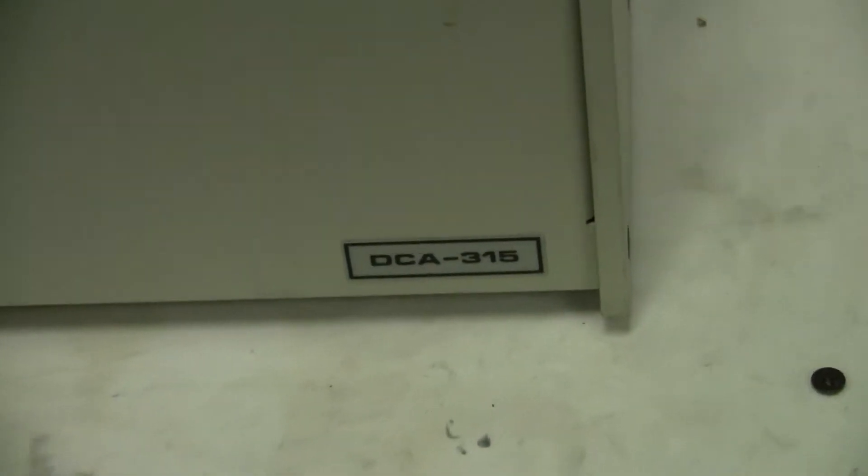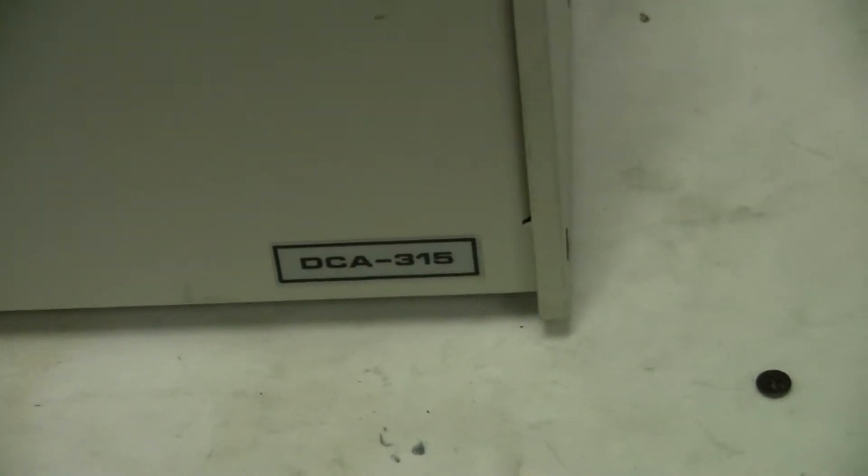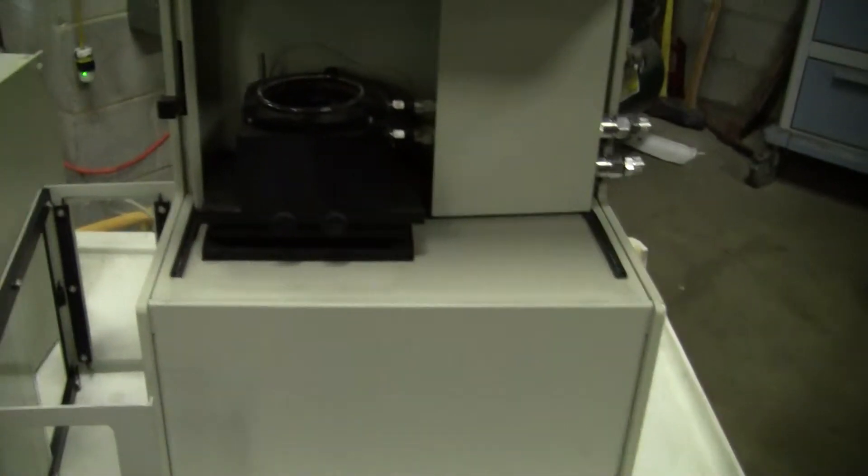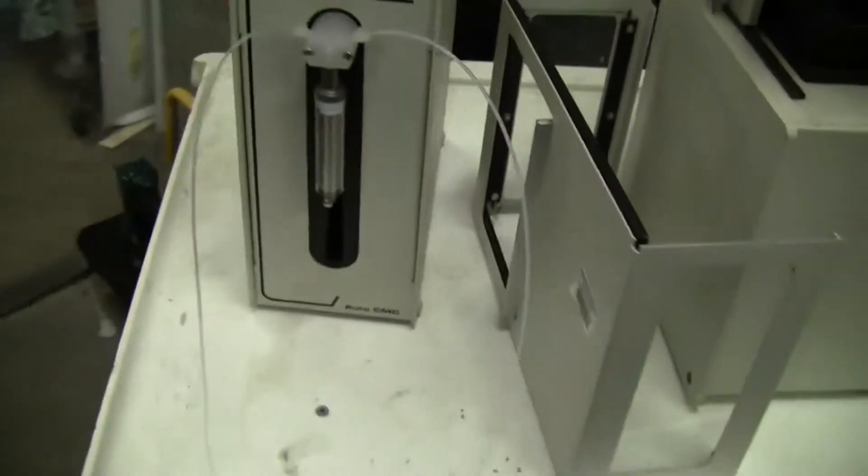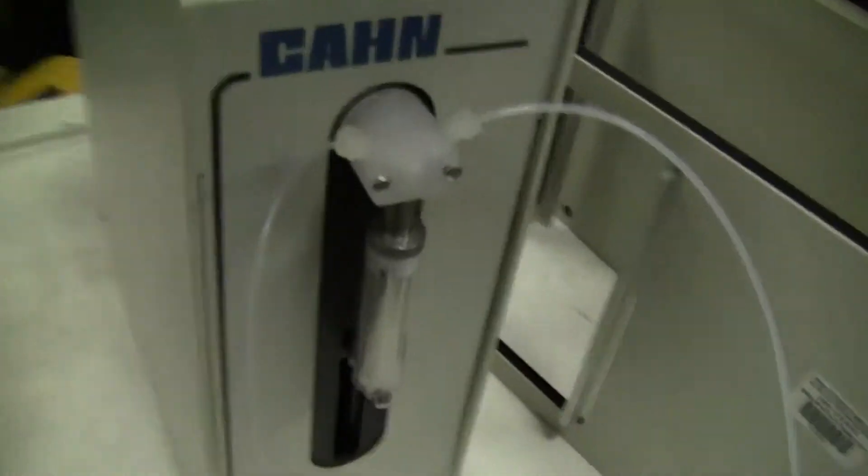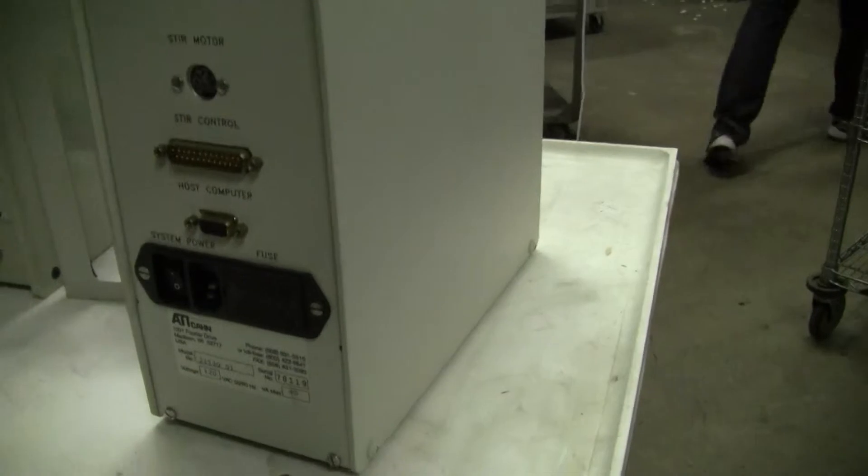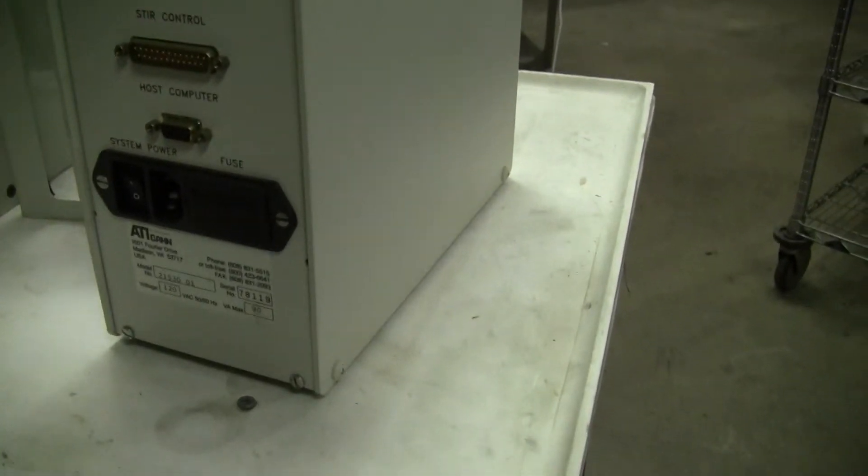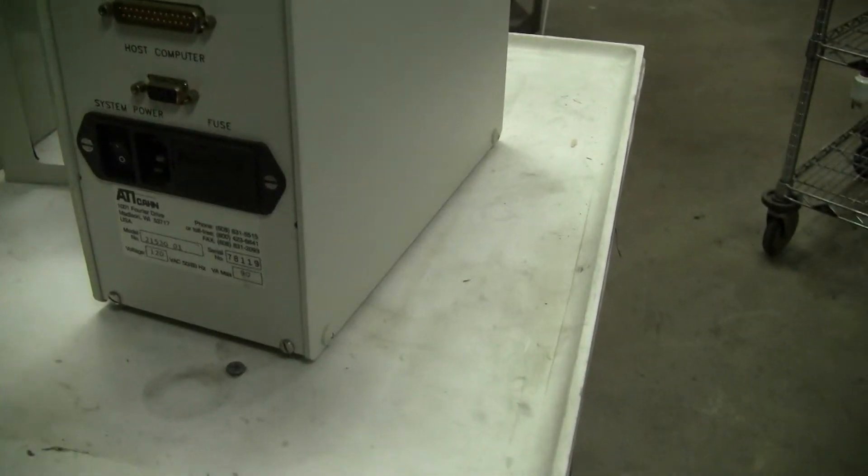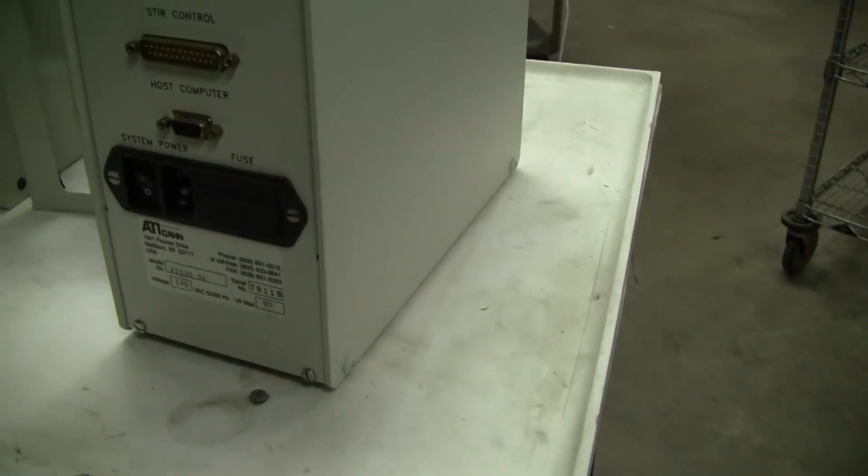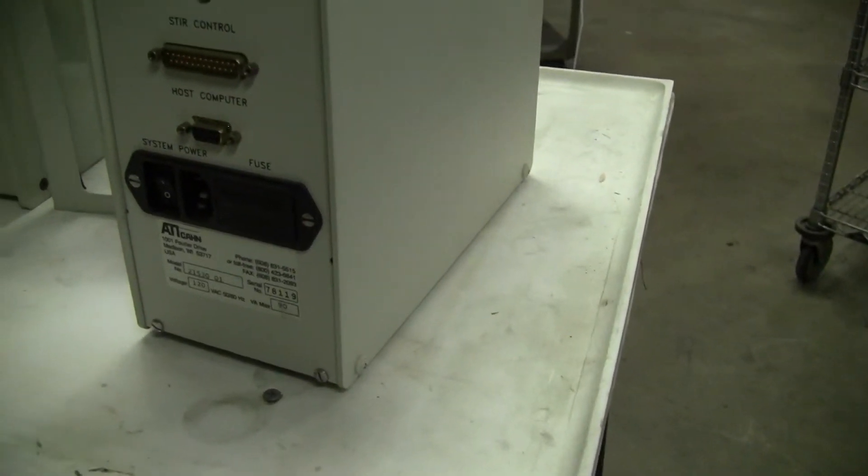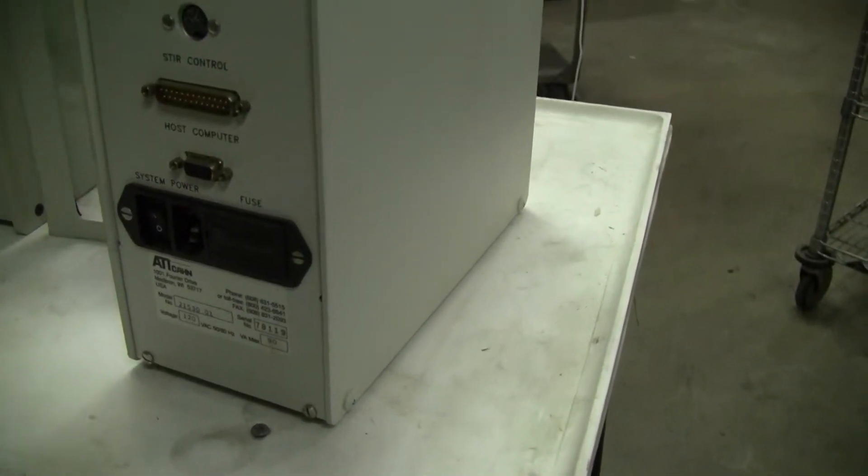It's a model number DCA315. It has a little syringe pump injection pump, also by ATIKahn, the model number there is 21530-01.